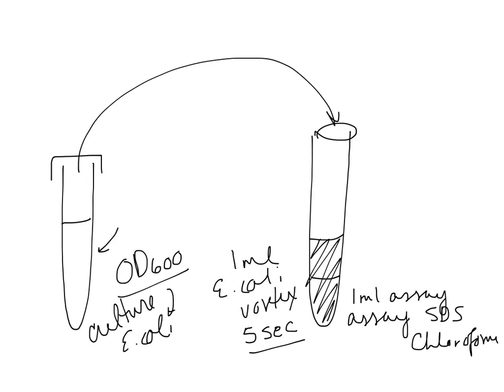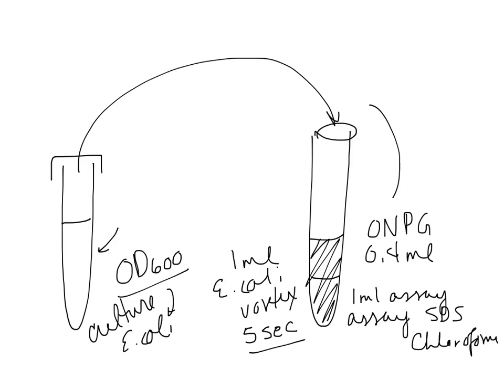When you're ready to go to the water bath, you need to add the one last thing to measure, and that is the ONPG. So we're going to add 0.4 mls of ONPG, and that's going to go into our tube, and we're going to vortex again, and then we're going to put it at 30 degrees C in a water bath.